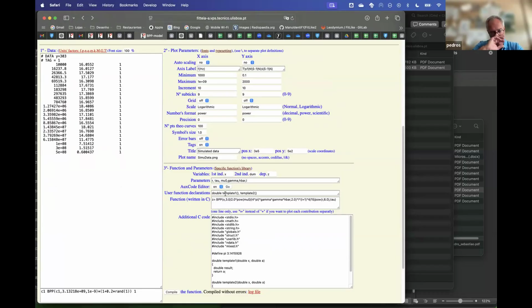Okay, so let me explain the error. Although you might find it strange, I have the expression declared as z is equal to something, so the dependent variable is z. And as you might see, I have here a first independent variable and a second independent variable, which is named dum. Actually, the name of this second independent variable should be the same as it is here in this particular tag.